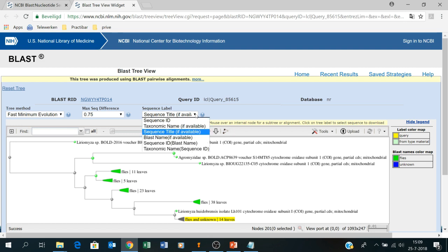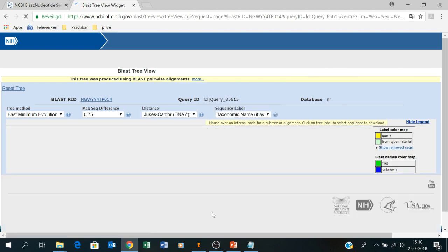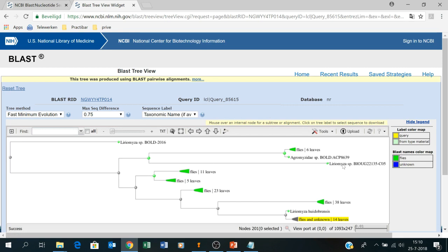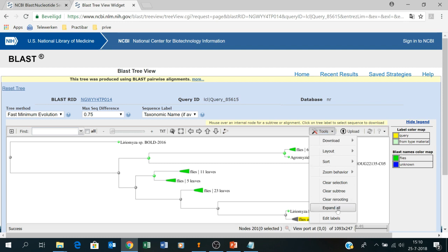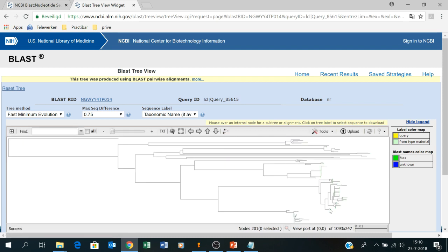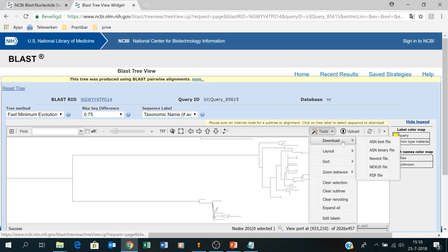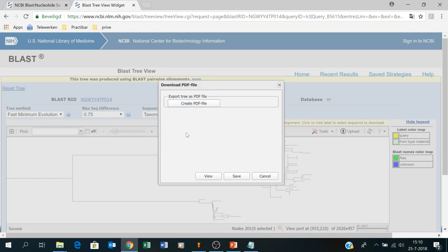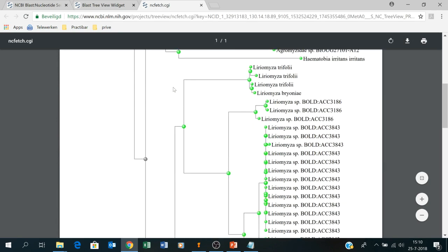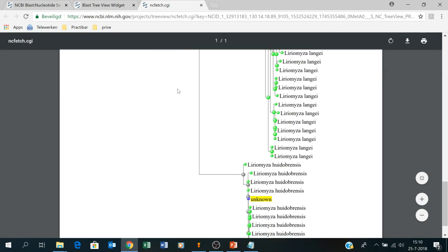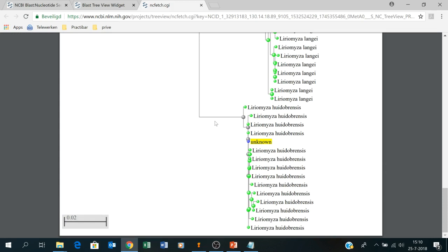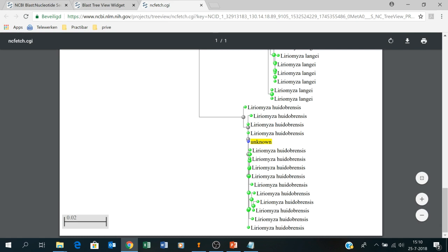The first thing to do is put the sequence label on taxonomic name so you only see the name — it makes it easier to see. You can click on the tree and use the tools to expand your tree and zoom in, but another option is to just download it as a PDF file. Opening the PDF, you search for your unknown and there it is — your unknown falls largely into a Liriomyza huidobrensis clade. So your unknown is very likely to be Liriomyza huidobrensis.